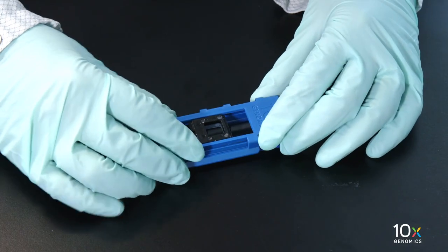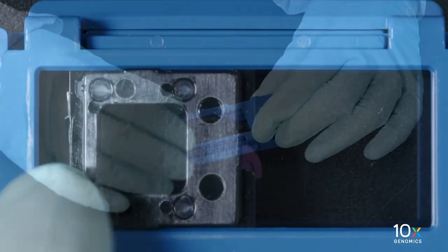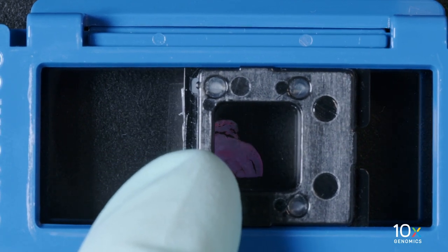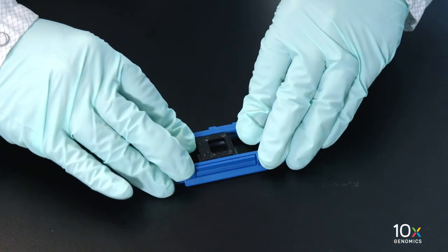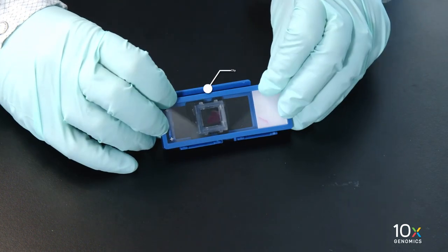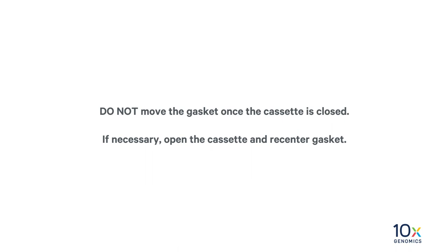Gently place the top half of the Tissue Slide Cassette over the bottom half. Do not assemble together at this step. Adjust the gasket such that it is over the Tissue Area of Interest. Apply even pressure on top of the gasket until it clicks shut. Verify that the clip is completely secure over the hinge. Turn the cassette over and verify the Tissue Area of Interest is within the gasket. Do not move the gasket once the cassette is closed.